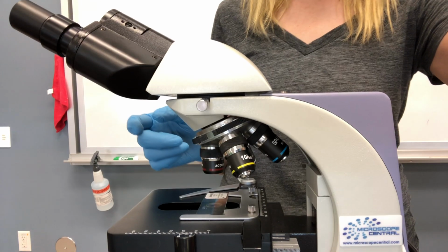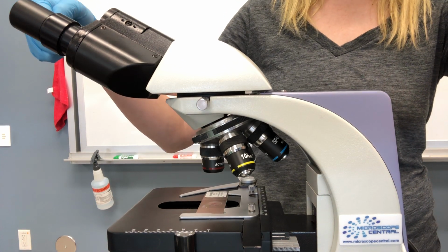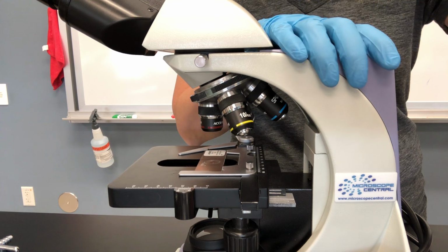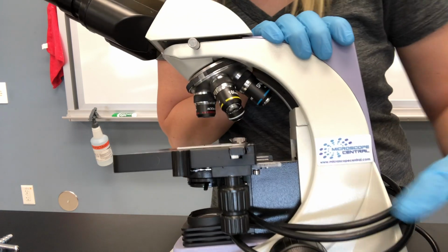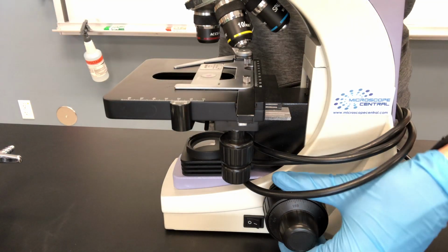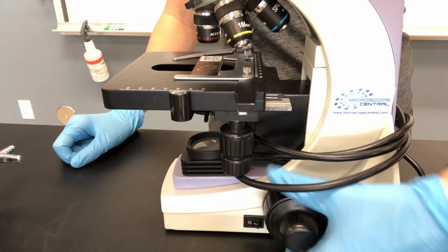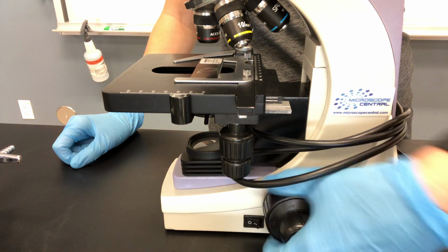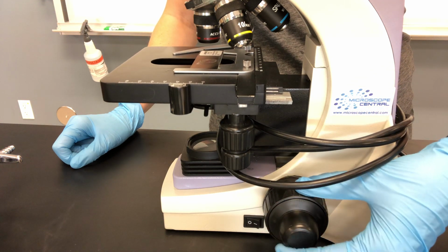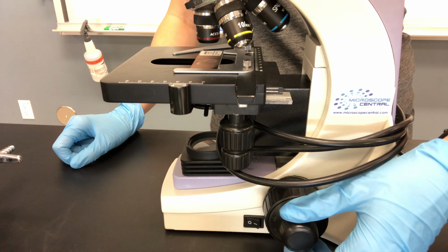All right, so once that's centered and you have your lights coming on, you're going to then use your eyes to look through the eyepiece as you use your coarse focus knob. Where's that? Way down here. Coarse focus knob is the big one, and if you'll notice, that's going to bring the stage all the way up and all the way down.